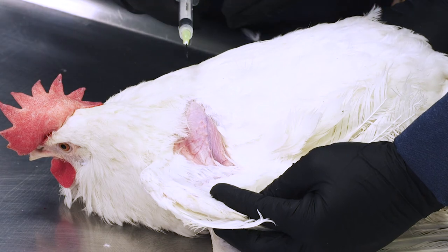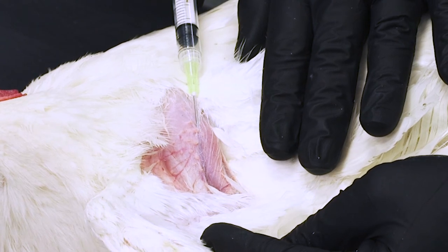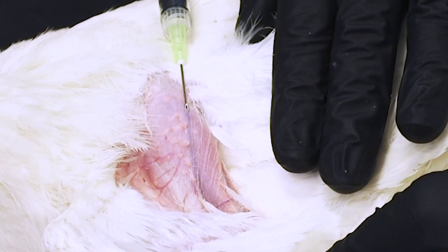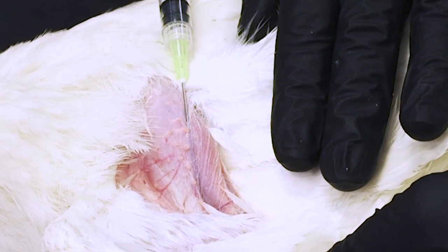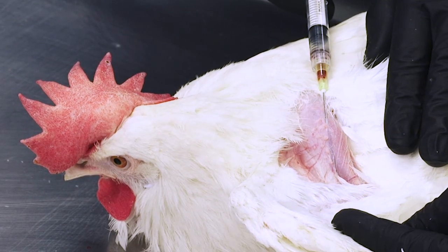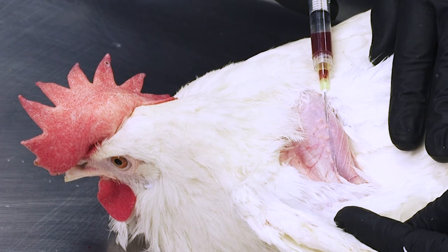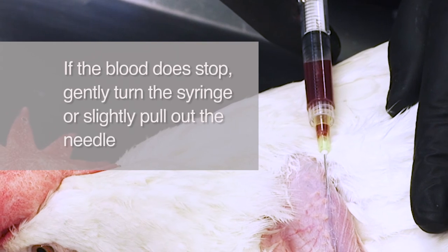As the assistant restrains the bird, the other person inserts the needle. Withdraw the plunger slightly to break the seal and create a small vacuum inside the syringe. To take the sample, insert the needle using a very shallow angle, nearly parallel to the skin, with the bevel facing up, and avoid going through the feather follicles. Slowly pull back the plunger, allowing it to fill with the proper amount of blood, but not too fast, as this may create too much vacuum and cause the wall of the vein to collapse, stopping blood flow. If the blood does stop flowing, gently turn the syringe or slightly withdraw the needle.